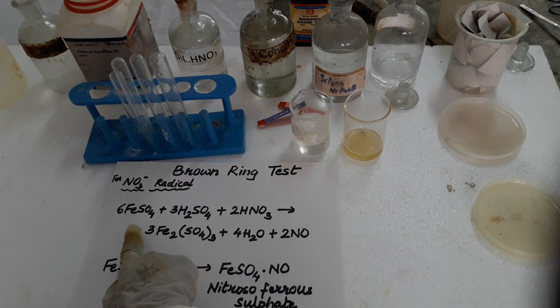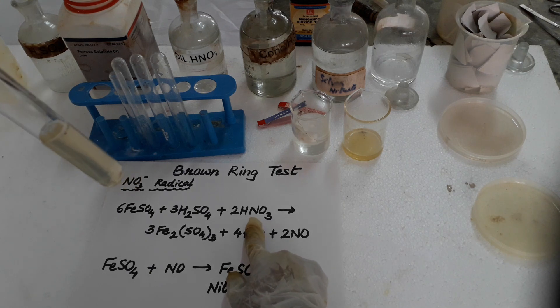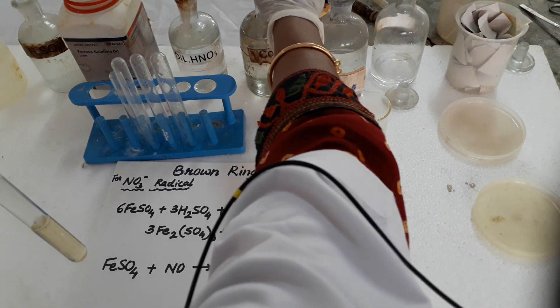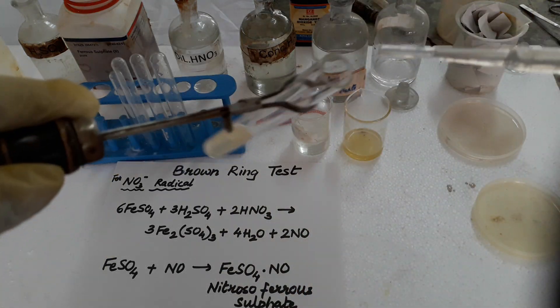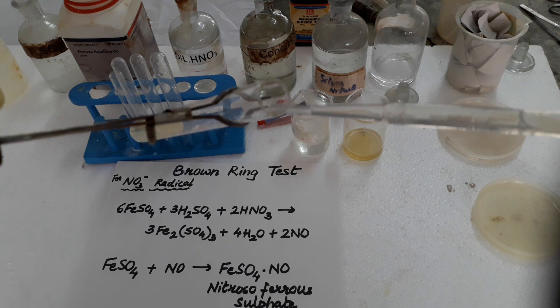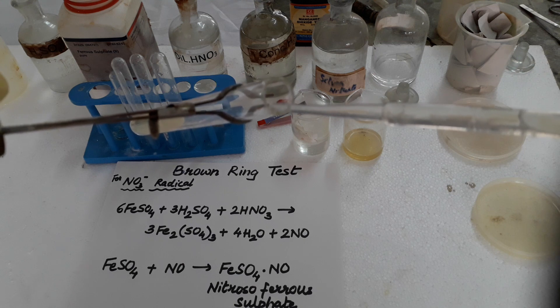Now you see the reaction. Ferrous sulfate and we have added dilute nitric acid, or instead of dilute nitric acid we can take any nitrate — potassium, sodium, any nitrate. I have taken potassium nitrate. And very, very slowly we have to pour concentrated sulfuric acid drop by drop without disturbing the solution.